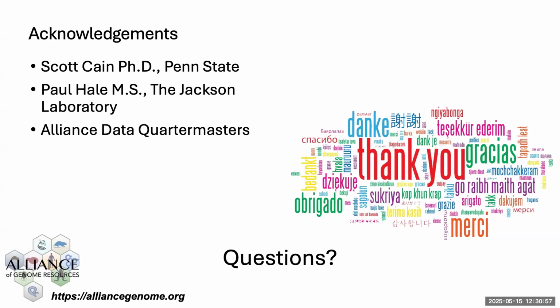Yeah, I sympathize because JBrowse2 is kind of a reimagining of what a genome browser can be, right? Up until JBrowse2, a genome browser was basically a line that had colored boxes on it. And JBrowse2 is so much more than that. But that comes with an increase of complexity for the user. I agree, Jeff, you did a great job covering just a few aspects of what JBrowse can do, because like he said, there are multiple things under that initial menu that we didn't even talk about.